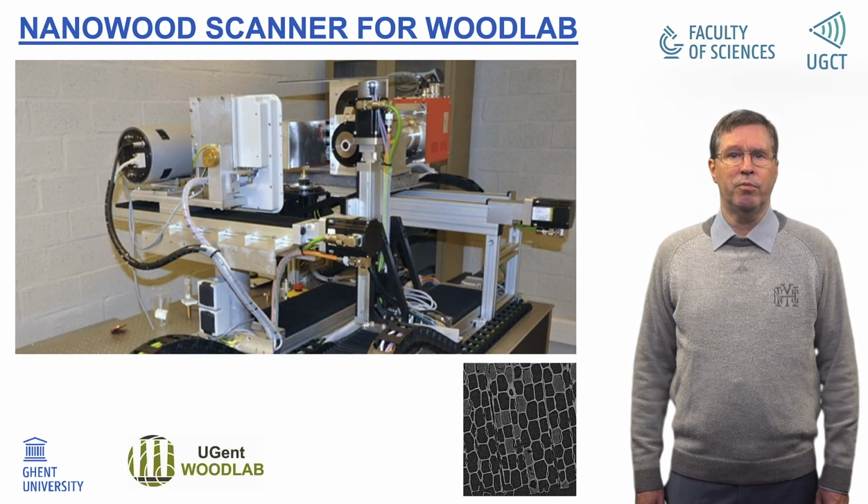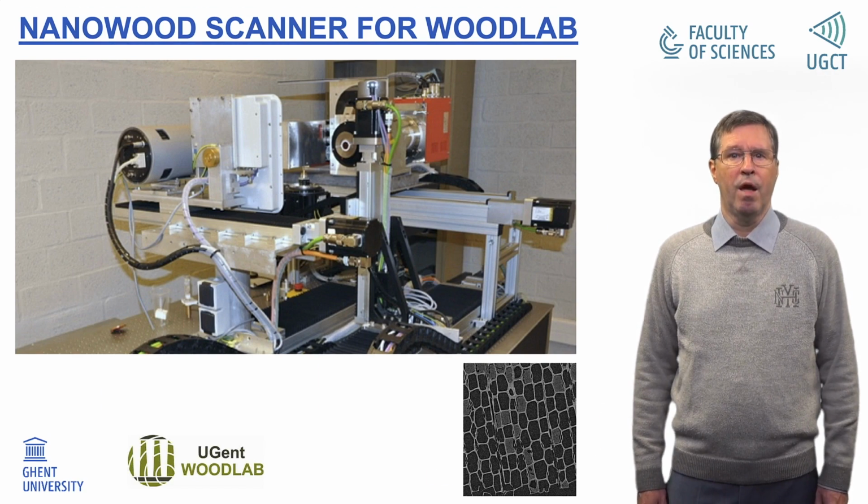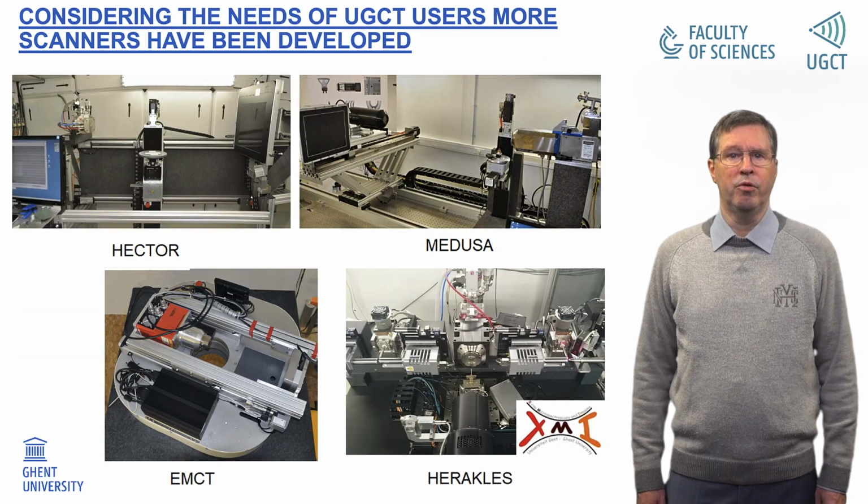Following a close collaboration with Woodlab, in 2008 the Radiation Physics Group developed a new scanner, a 400 nanometer resolution nanowood scanner tailored for the wood research of Woodlab, which joined UGCT in 2009. Afterwards, the Hector, Medusa, EMCT and Heracles scanners were developed, obtaining the very performant complementary UGCT scanner fleet.